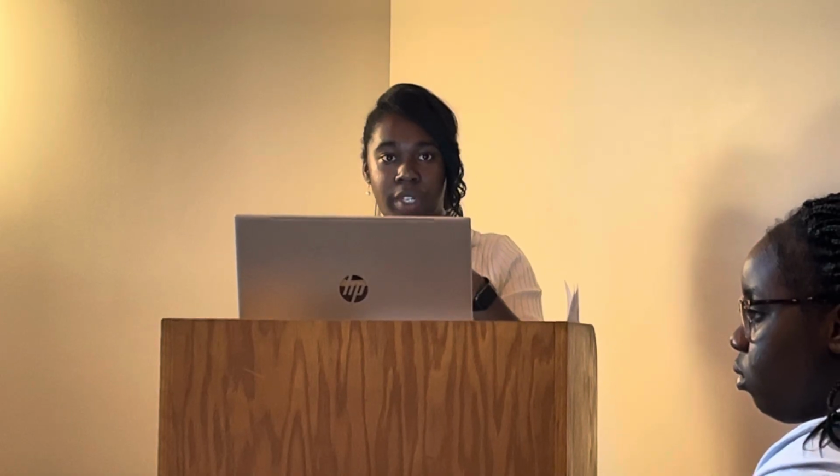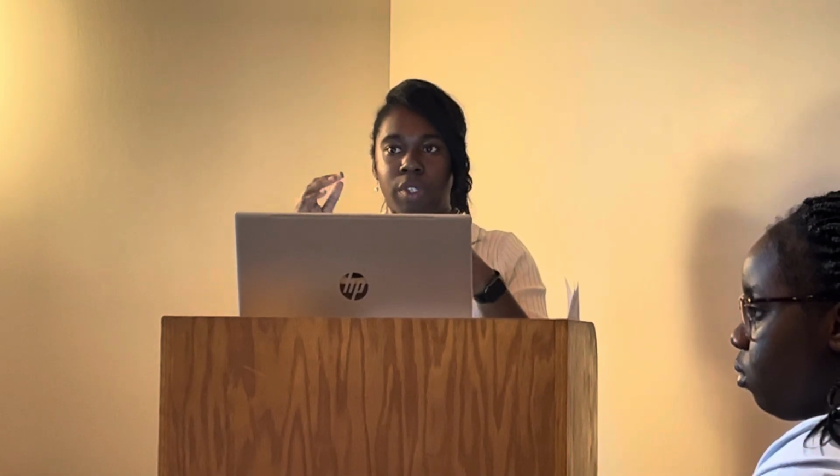And so yeah, why do we think this happened? Honestly, the reason why we can assume that this happened is because of the tail. So obviously the OSDA, we know, can actually create the zeolite and crystallize it. So the only other option is the tail.